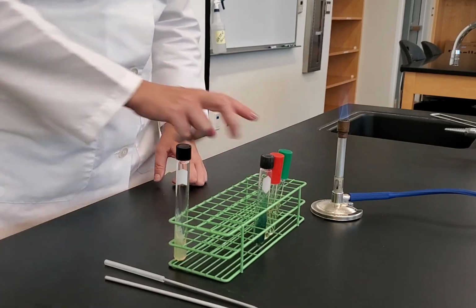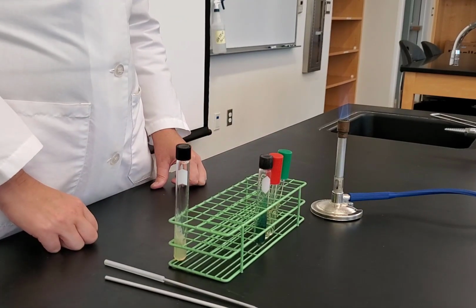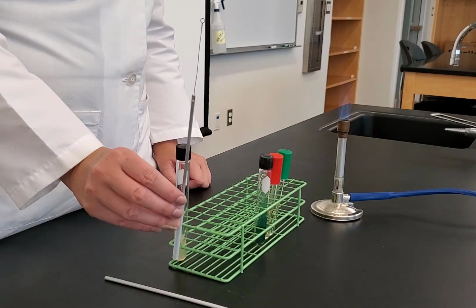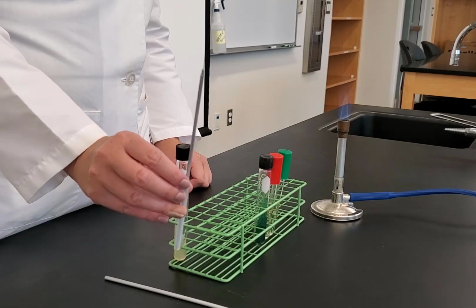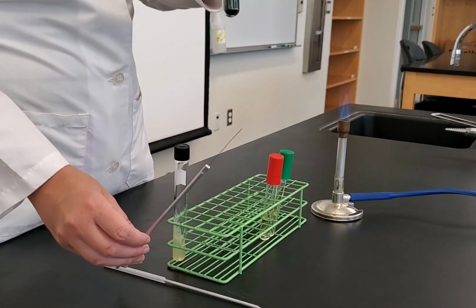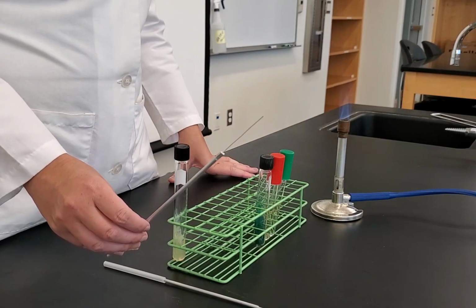So when I go to inoculate the 2 broths, the green cap and the red cap, which tool am I going to use to inoculate those? And the answer is we want to use a loop, because when we inoculate a broth, we want to use our loop. Our citrate is on a slant. Normally when we inoculate a slant, we use a loop.